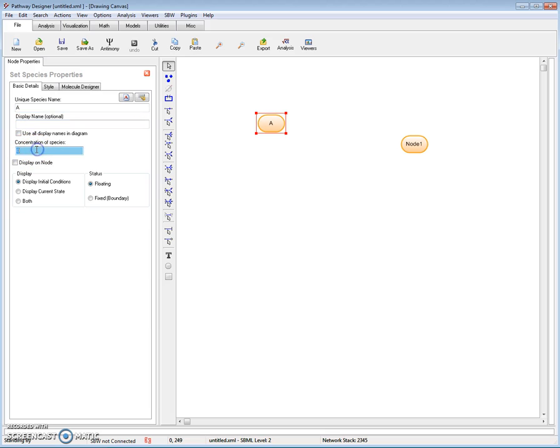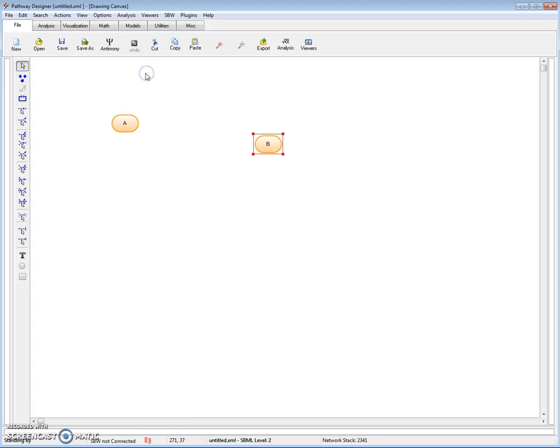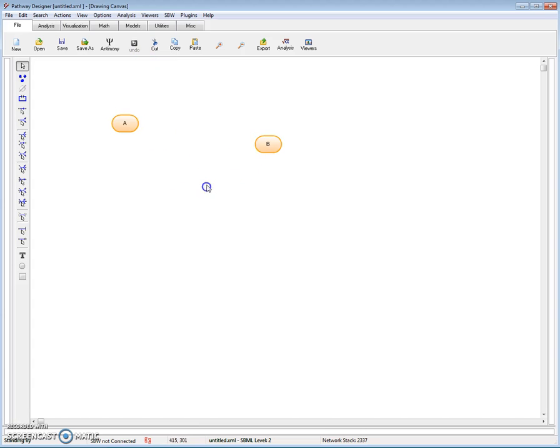Here, I'll give it an initial concentration. Let me move to node 1. I'll rename that to B. I'll keep its concentration at 0. I've finished that. I close it.